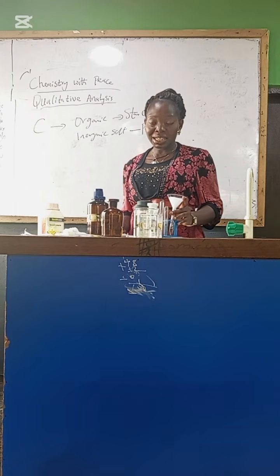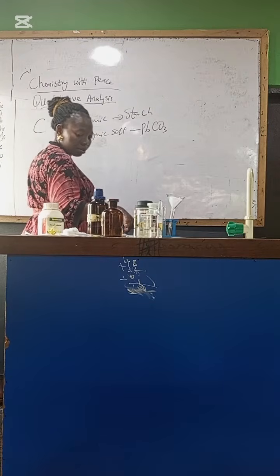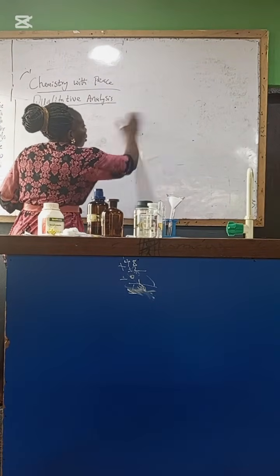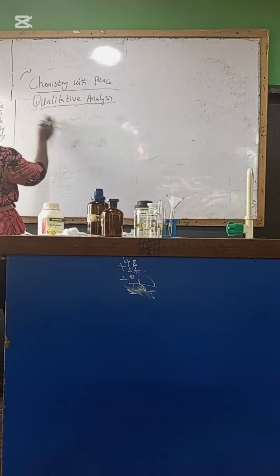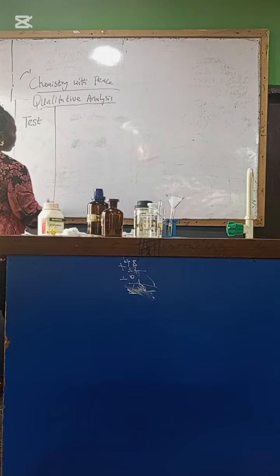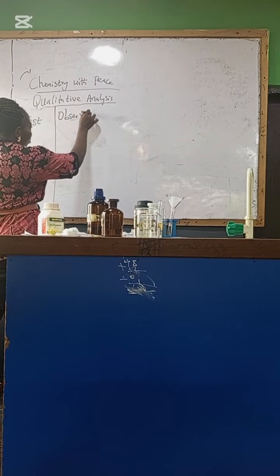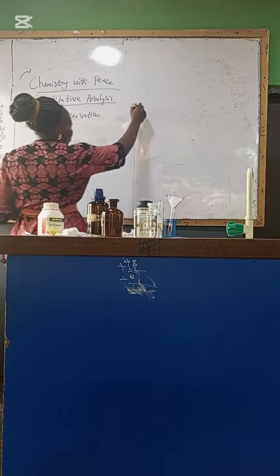In your qualitative analysis, you make a table: test, observation, then inference.